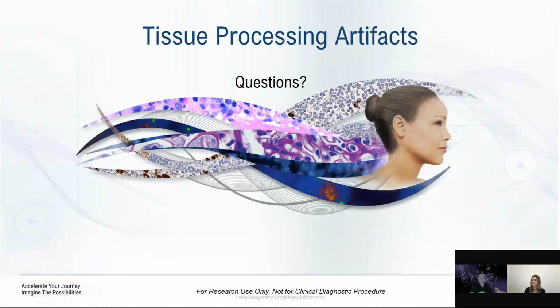For other markers, they're a little bit harder. We look at getting the tissue fresh from the time you ligate to the time you get it fixed for about an hour. I think it varies a little bit, maybe with some of the markers that are a little bit more sensitive, like HER2. There are some nuclear antibodies that tend to be a little bit sensitive too.